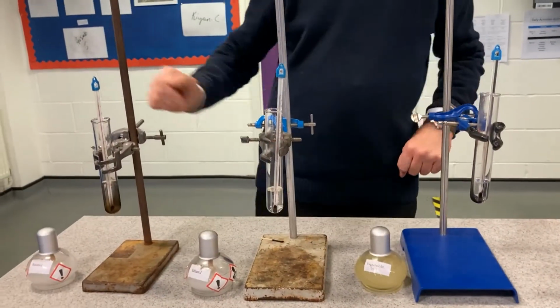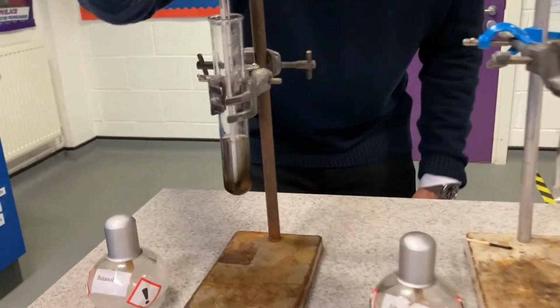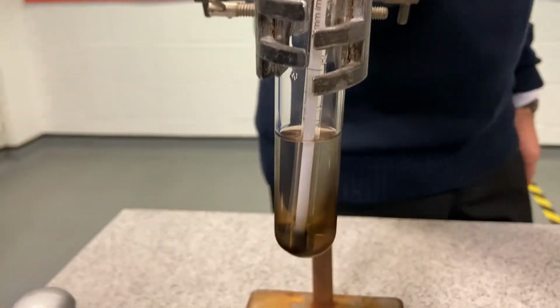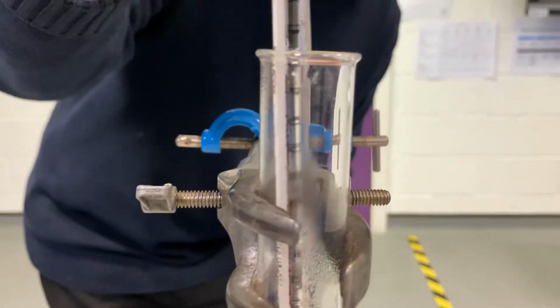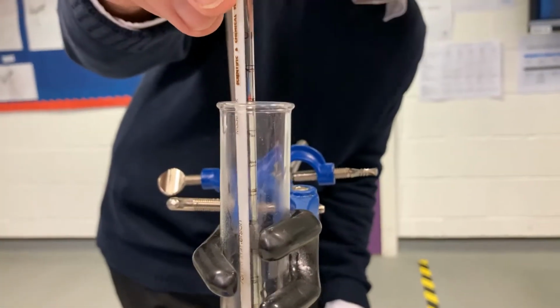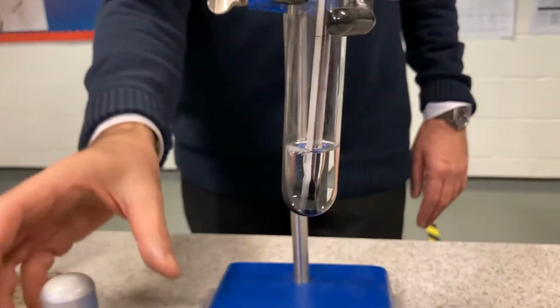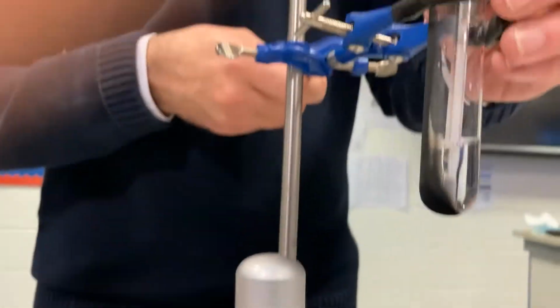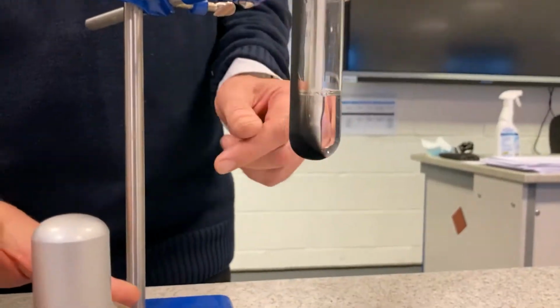So, this one has risen. Well, that looks like the hottest. That has hit boiling point. That has reached 100. That has reached about 78, the ethanol. And the last one, the vegetable oil, has reached 55. So I would say vegetable oil is definitely the worst. It makes lots of black smoke. It's horrible and manky. And it doesn't heat it up so much.